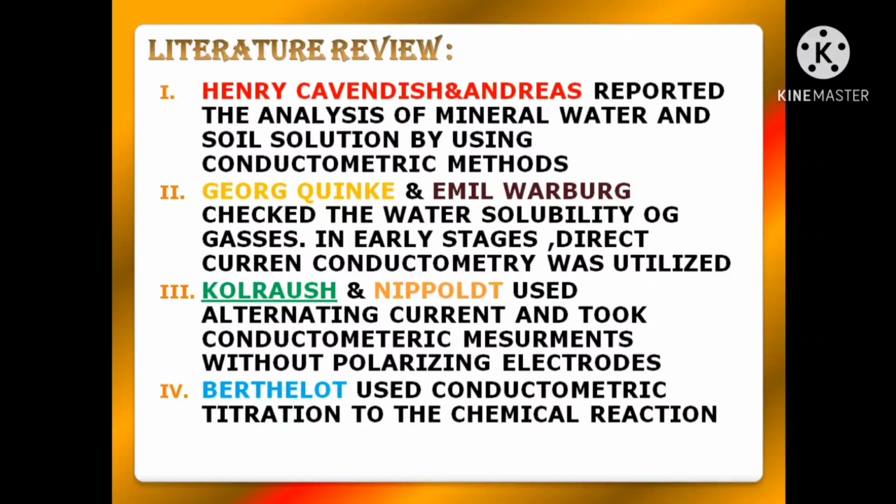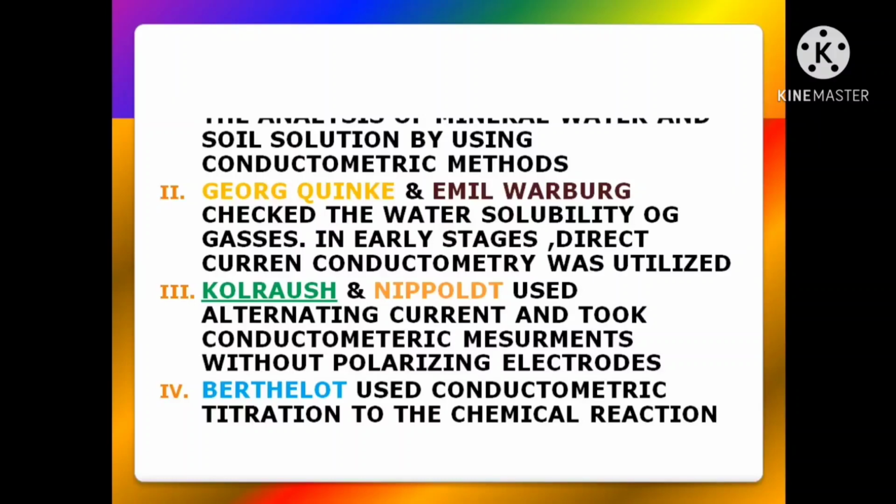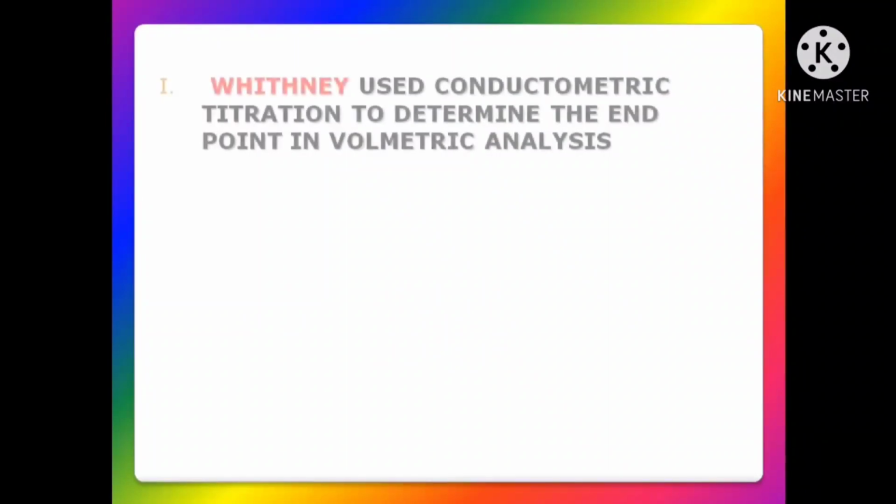The scientist Berthelot used conductometric titration for chemical reactions. The scientist Whitney used conductometric titration to determine the endpoint in volumetric analysis.